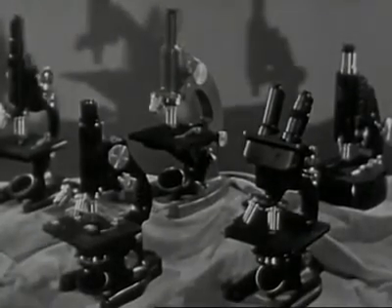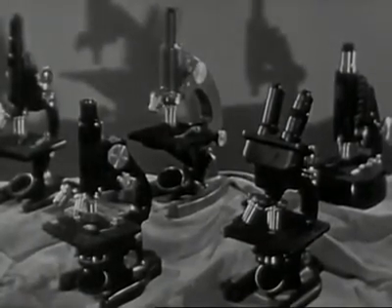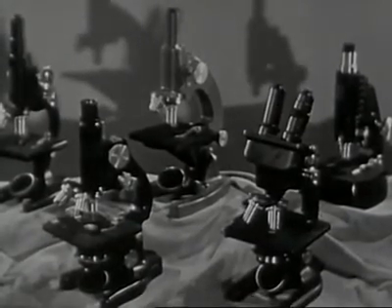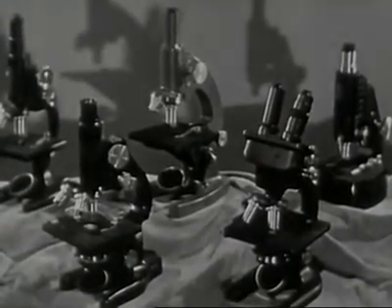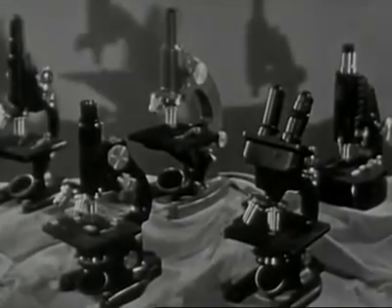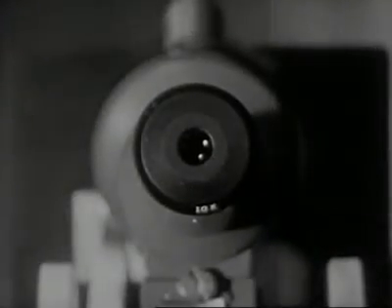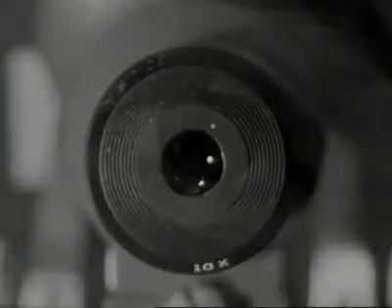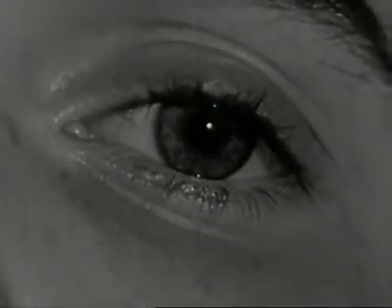But essentially, they are all for the same purpose: to magnify plant and animal life and other matter of minute size to a degree that it may be studied. The powerful eye of the microscope extends the range of your eye when you use it correctly.